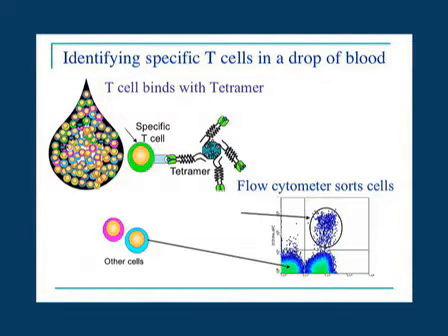And so with previous assays, things like CFSE or proliferation assays that have been around for decades, what you're getting is just kind of an overall bulk measurement of what's going on with the whole T cell population. But you've got millions of T cells in the body, and they see a whole diverse set of patterns. If you're lucky, maybe 1 in 200,000 to 300,000 of the cells in the sample will be the one that you're looking at. And that's why this assay does that enrichment step.